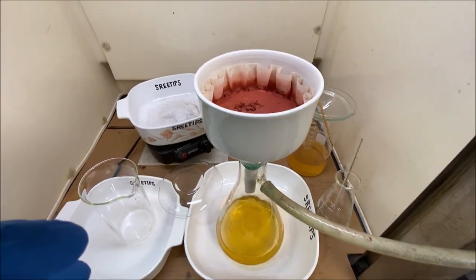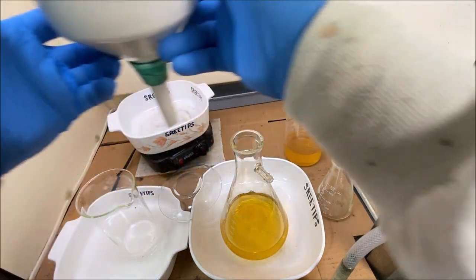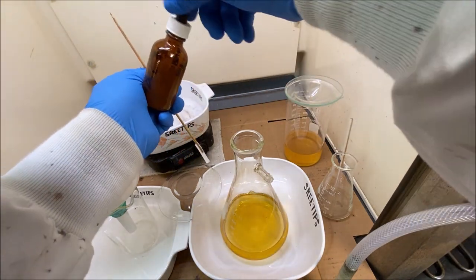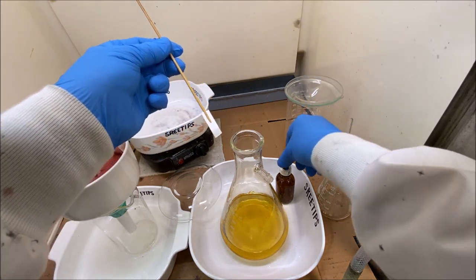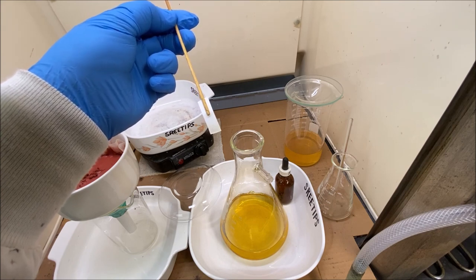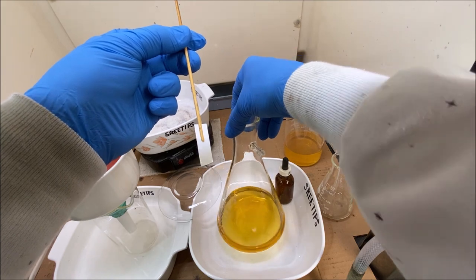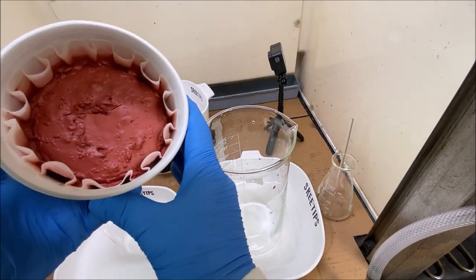We've pulled about half a liter of hydrochloric acid through our precipitate. Now I'm going to take the funnel off and test this waste solution with a piece of filter paper to see what metals we have in solution. There's not a whole lot of anything in this solution, so we'll just add this back into our stock pot.